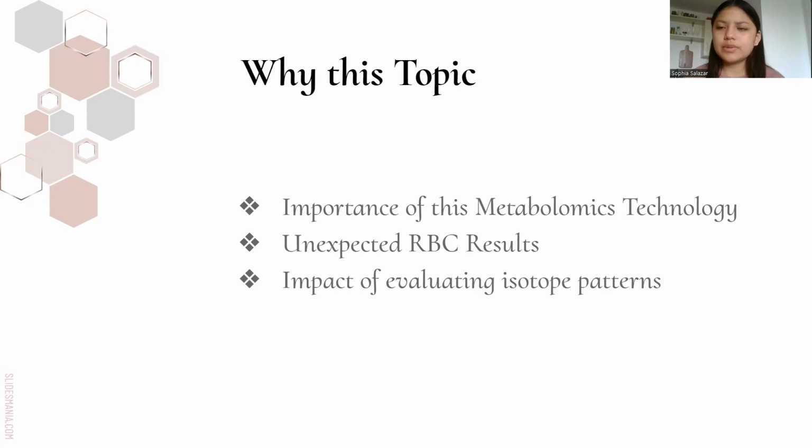It was also interesting to explore that a mitochondria-free cell, like the red blood cell, does have a flux in the TCA cycle that is reliant on using the mitochondria to function. So it was interesting to see that it's expected that there would be no TCA cycle present in the red blood cells to generate energy, but through the results, we do see it.